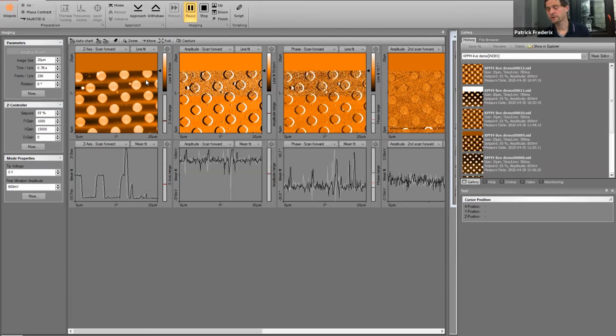I think the trick there will be the preparation. It's certainly possible if you take a 2-component epoxy cement and put that on the surface. If you can cure it at room temperature, and just before it's cured, add the powder substance to this epoxy silver to contact the powder, then you can measure it.